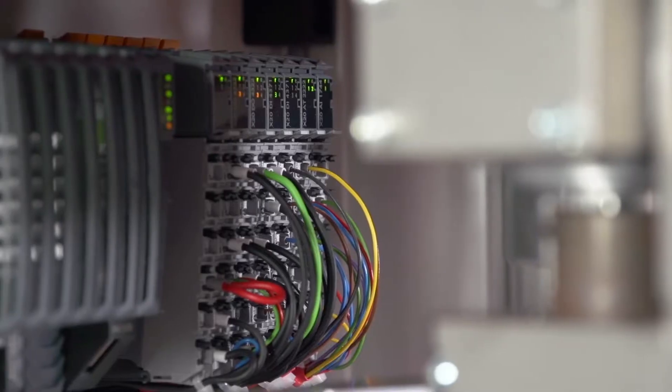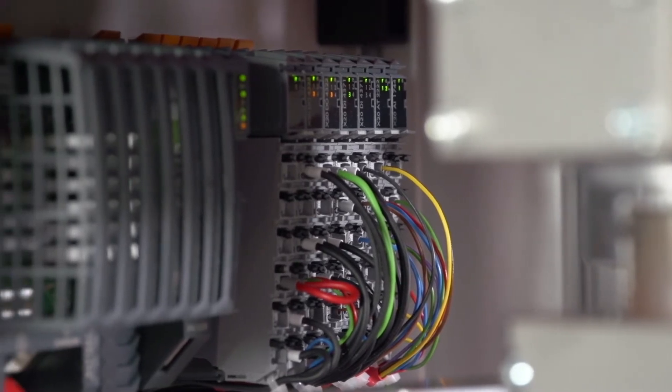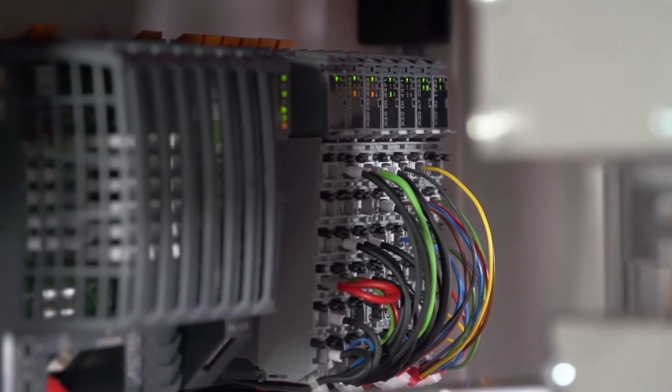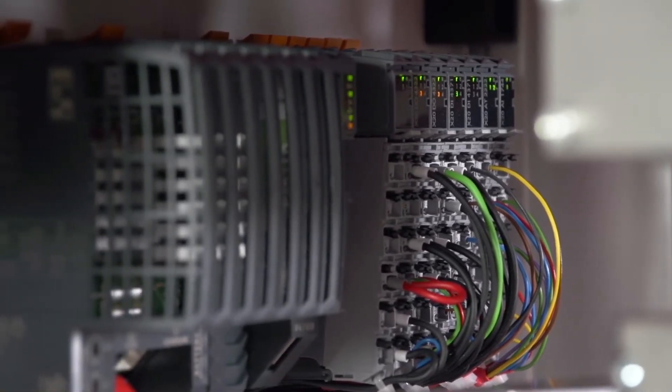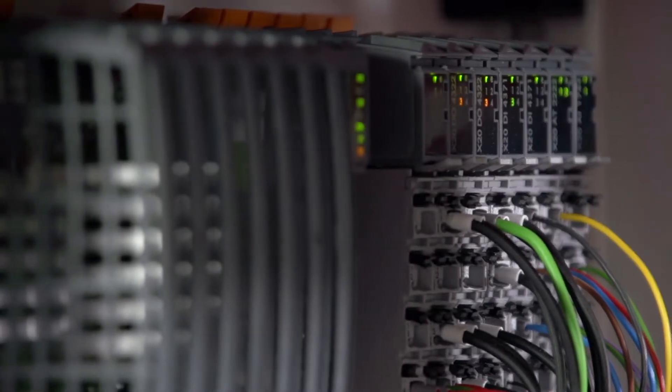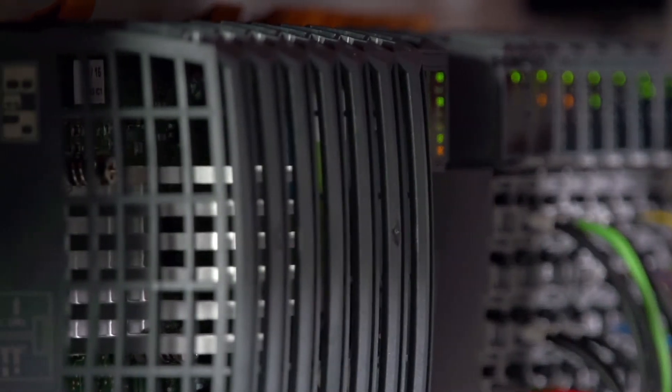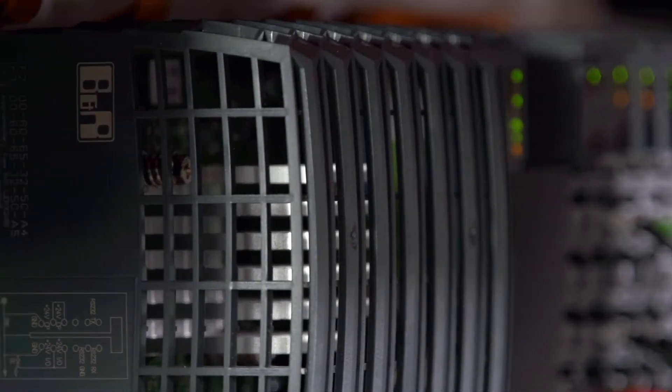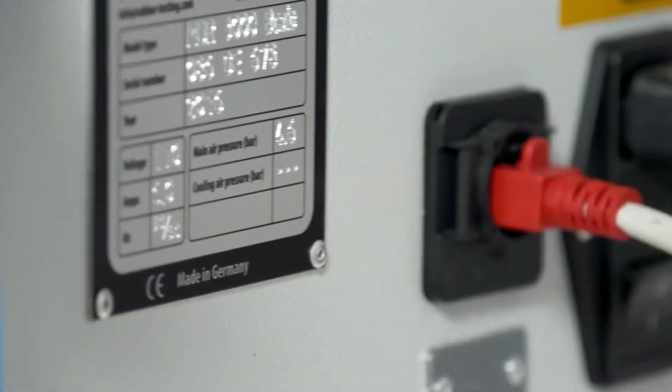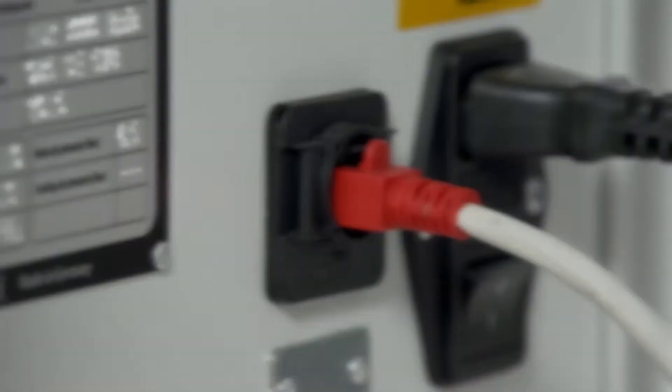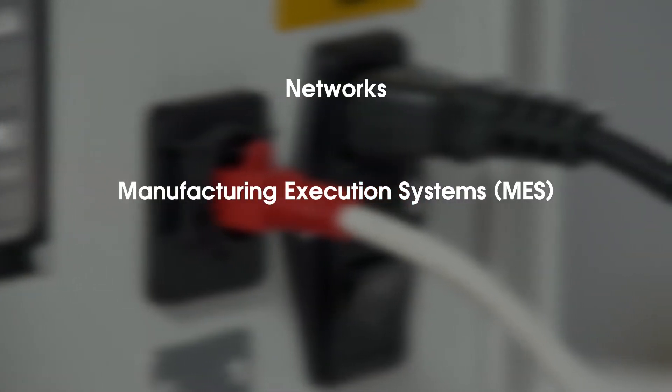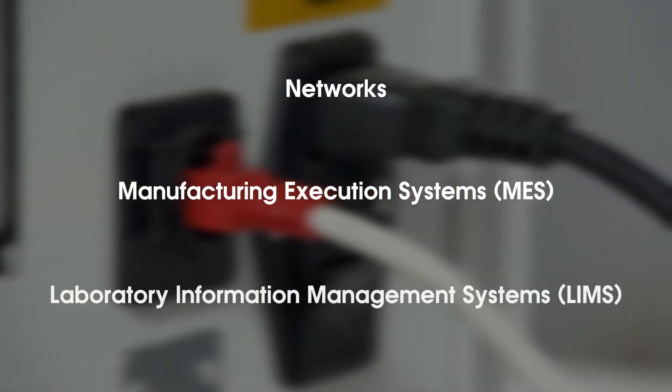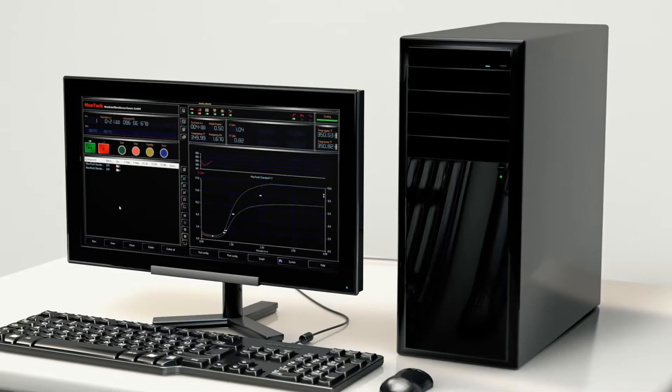To process and analyze the highly complex data streams from testing, the MDR3000 Basic is outfitted with a 24-bit PLC with 10 kHz high-speed data sampling rate. The MDR3000 also features Ethernet connectivity for the fastest data output to networks, manufacturing execution systems, and laboratory information management systems.